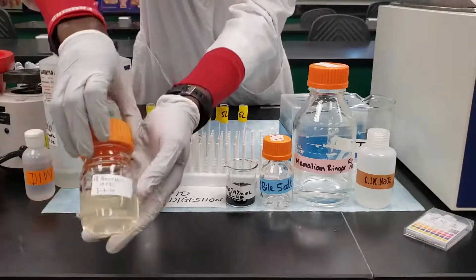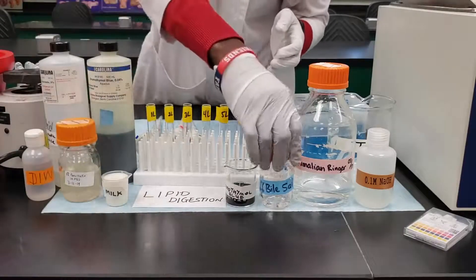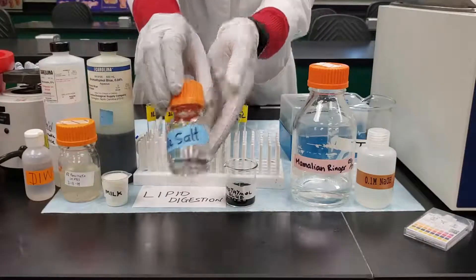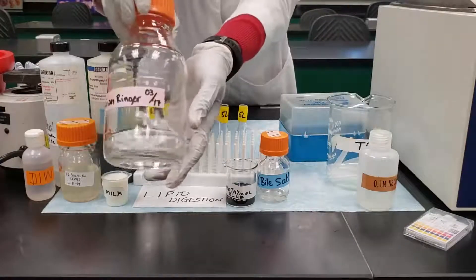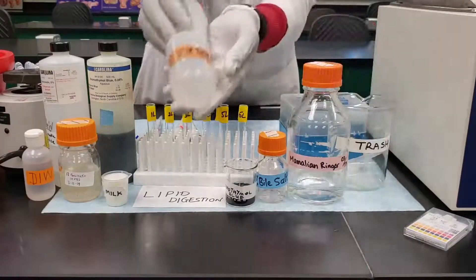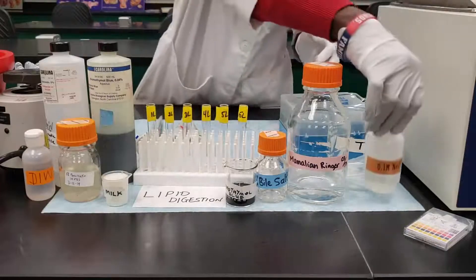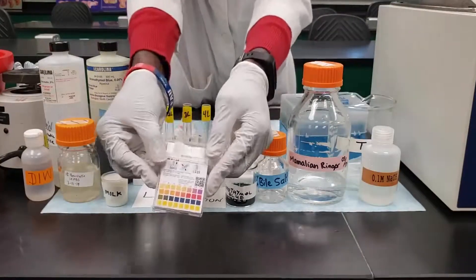We're going to use the pancreatic juice, and apart from that we're going to need the bile salt, which is very important — it's essentially an emulsifier that acts to break fat molecules. We also need the mammalian ringer solution as we've been using in previous experiments, and sodium hydroxide (NaOH) and the pH indicator.